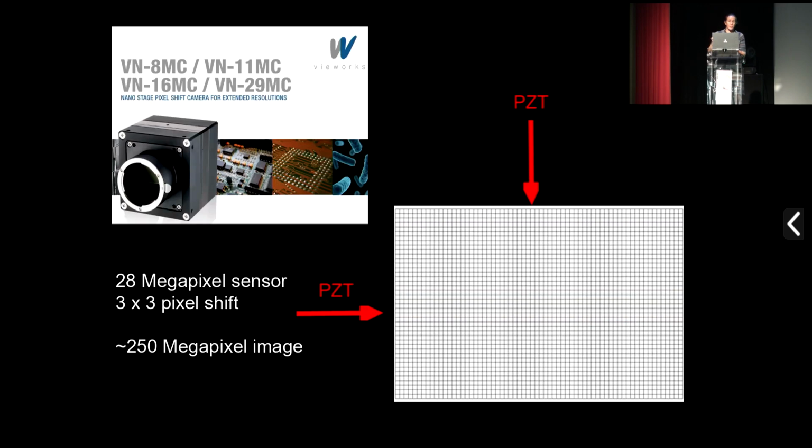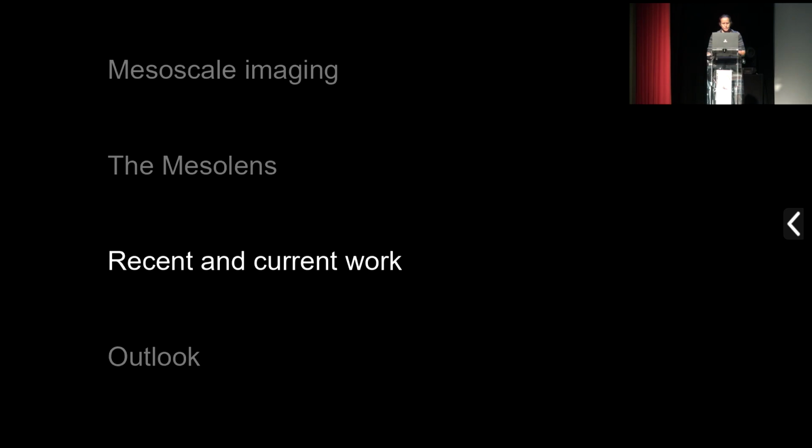There's now a faster version available. It should do about 3 frames per second. So it might be possible to put us into the space where we can do calcium imaging, millisecond exposures. So that's maybe one to watch.